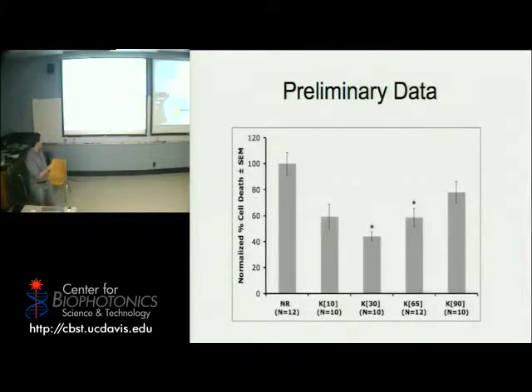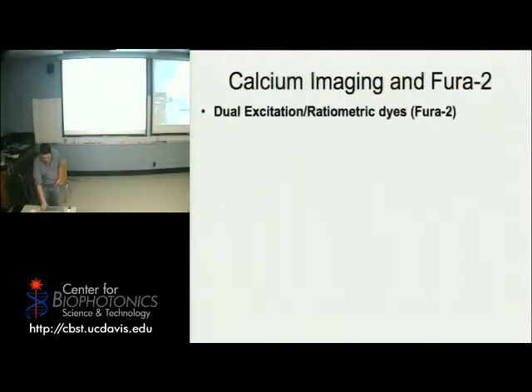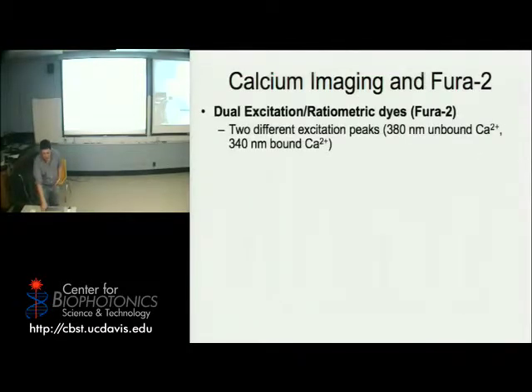And so no injury wouldn't be zero, but it would be down there. Even with no injury, they're in culture, so they just die. So do you guys know ratiometric dyes?